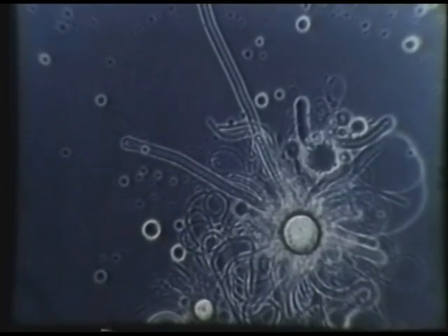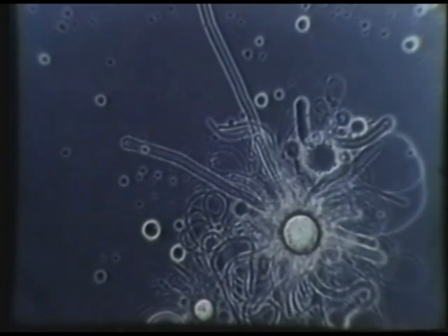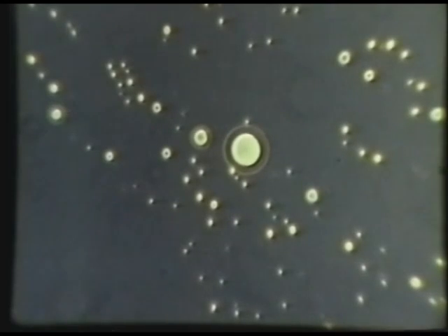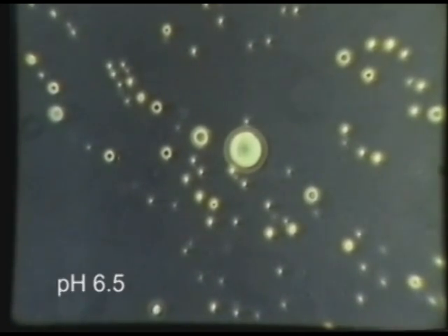This film shows that long-chain fatty acids produced by lipolysis can form myelin figures under certain conditions. Droplets of trioleoylglycerol, 1 to 27 microns in diameter, were suspended from the glass cover slip of a flow-through chamber, and complexed with lipase by perfusing the droplets for seven minutes with pancreatic lipase in sodium chloride solution at pH 6.5.